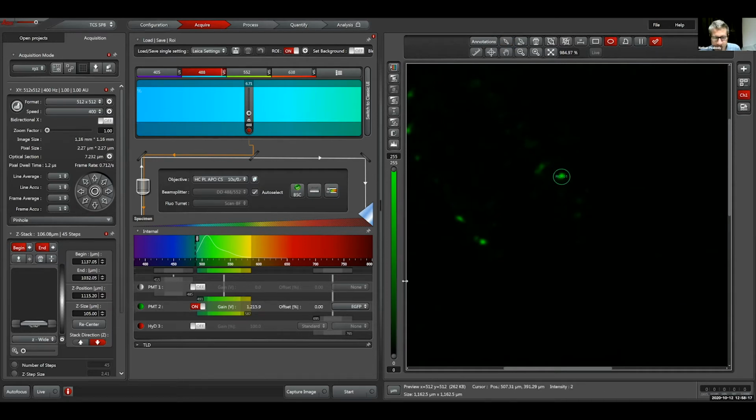Okay, that's our region of interest. Now let's, oh, the Z stack is more or less set for this. That's great. But we won't do the whole, let's just do the regular 2048 by 2048 one.